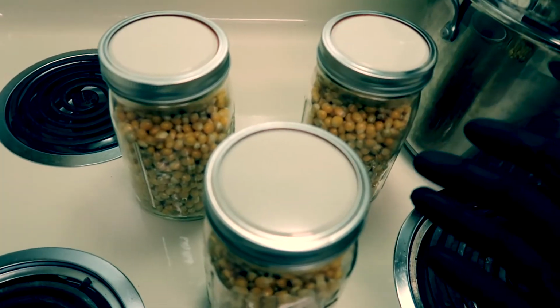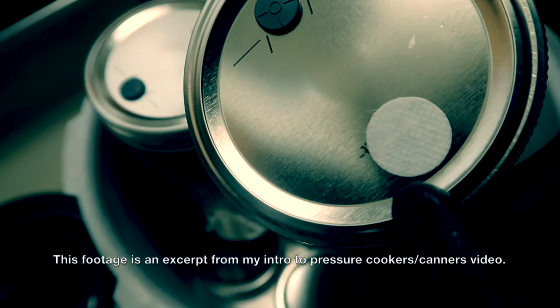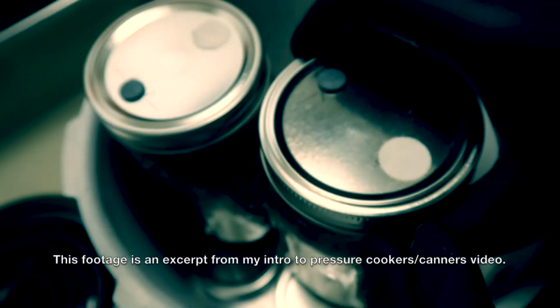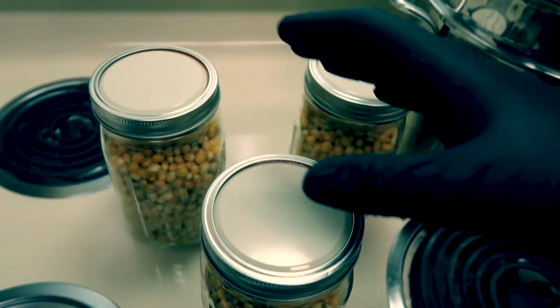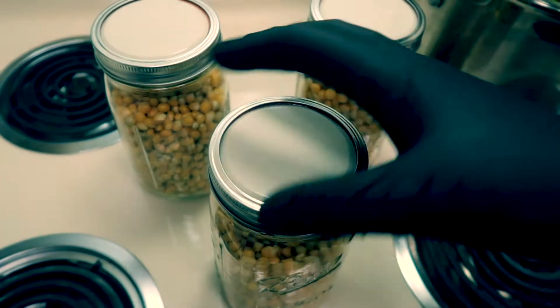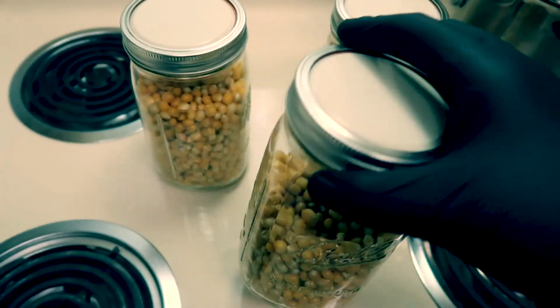The reason why people put tin foil over their jars is because they usually have a synthetic filter disc or micropore paper tape on top, and that foil acts as a shield to stop any of the moisture from dripping on top of the filter and leaking through into the grains. You can still choose to put the foil over these lids. It can always help to act as sort of a dust cover as you're moving your jars from the pot to your inoculation area or anything like that.